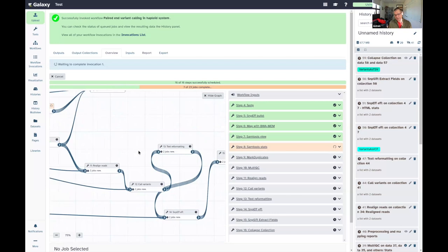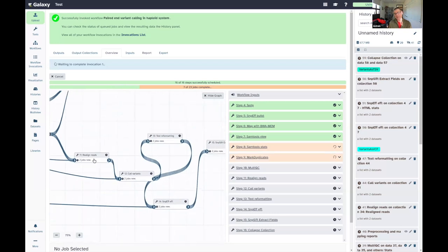And then we go into the entire variant calling with read realignment, ensuring that gaps are padded in a consistent way. We call variants using a tool called LoFreq. And this is the difference between, for example, haploid variant calling and diploid variant calling. LoFreq is a very simplistic variant caller. It does not consider surrounding haplotypes, the surrounding haplotype neighborhood.